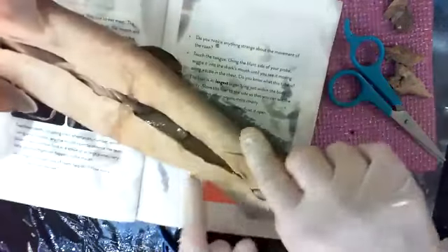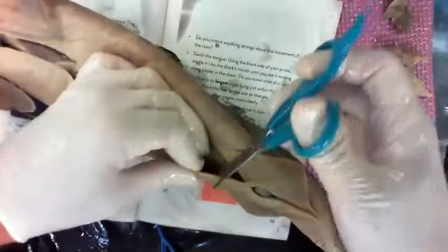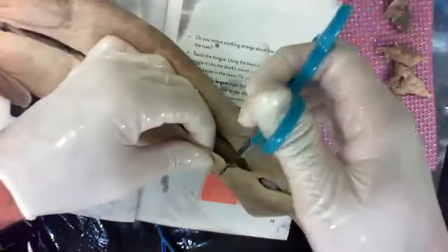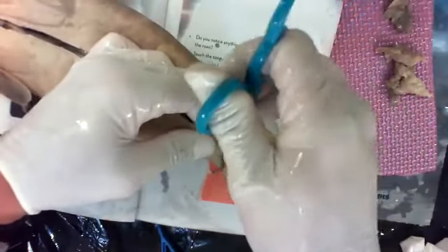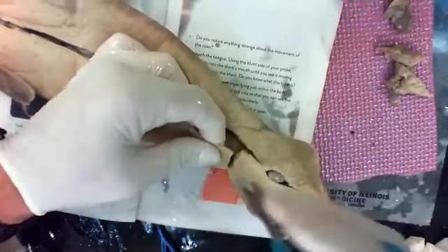So where there's a ring that comes around here and holds the fins in place like a hip, that's what you cut through. This is not in the book to cut, but I'm going to follow that cartilage right above it, so superior to it, and I'm cutting. Wow, this might be the last trip for these scissors. The skin's really dulling them fast. So I cut right above it and cut over to the side. Still doing it. Cut, cut.